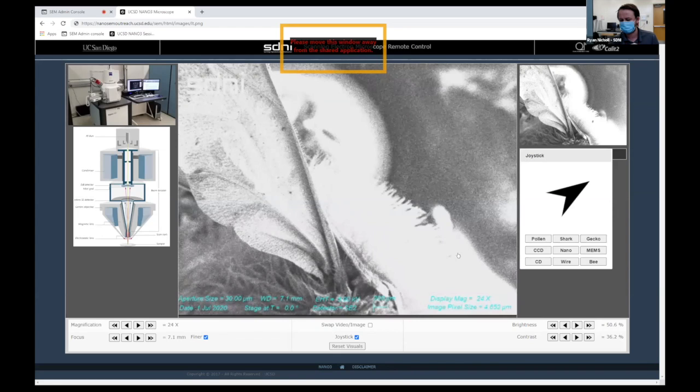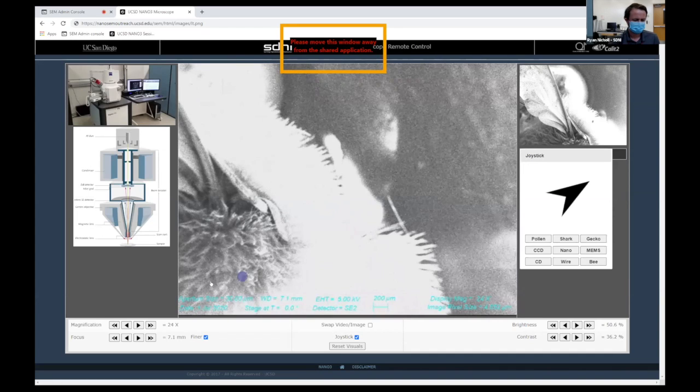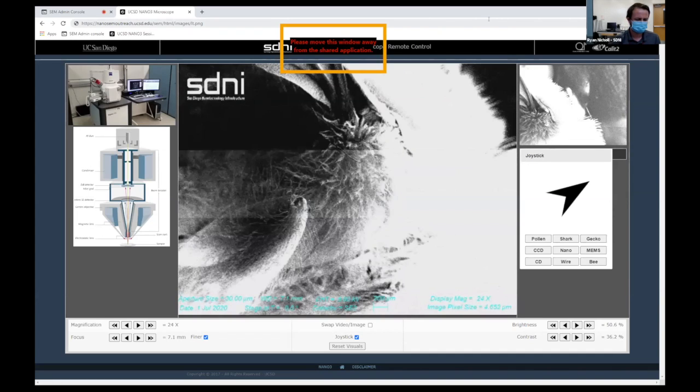So this is currently the wing? The top left of the image coming down to the bottom center is the wing, I think. I don't know what that side is yet. I'm a little bit lost personally. I'll help you out with the brightness here. I'll tweak the detector a little bit.